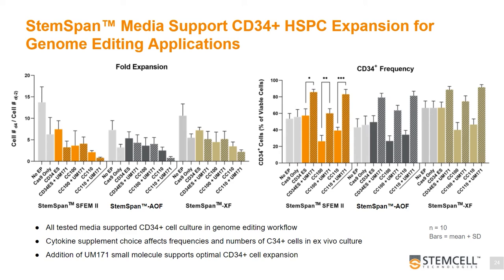Based on these data, we concluded that all media, SFEM2, AOF, and XF supported CD34 cell culture in genome editing workflow, and that among cytokine supplements, CD34 expansion supplement in combination with UM171 molecule supported optimal CD34 cell maintenance.